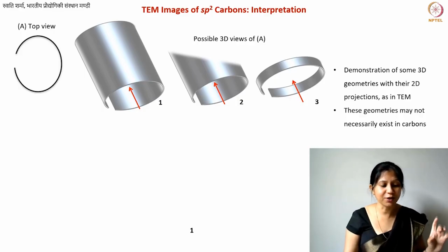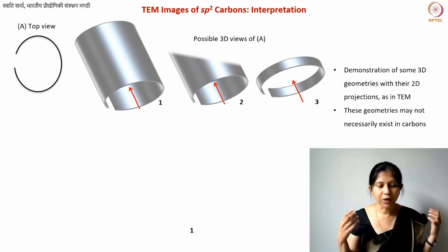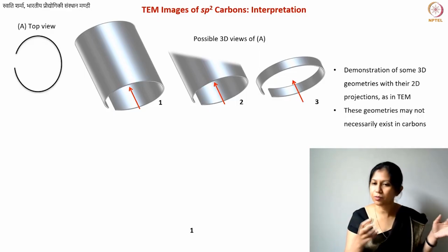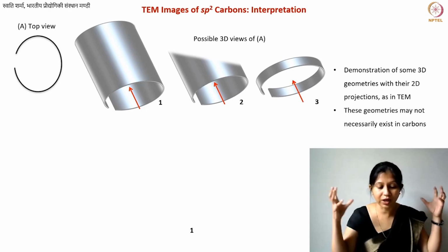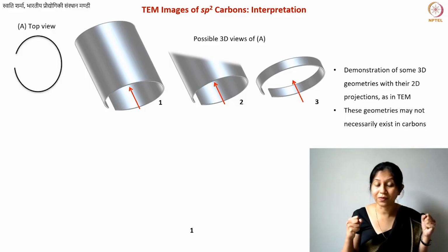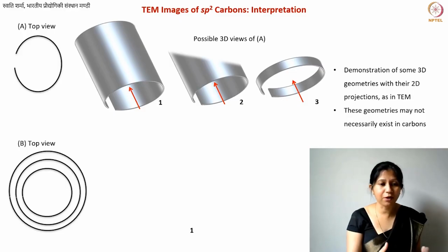Okay, but of course, if you know other things about the material, like you already know the X-ray diffraction pattern, other information, chemical information, surface property information, porosity information, whatever, or the material density. Density becomes important in the case of non-graphitizing carbons because you may have closed porosity, right? All of this information, you can integrate it with your TEM information. Okay. What else? I have made a couple of these little structures just for your understanding.